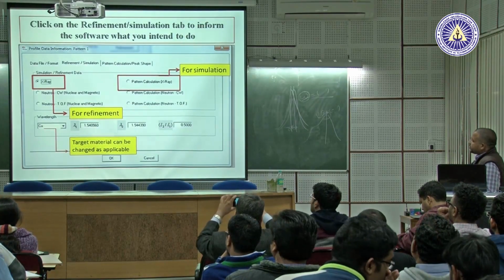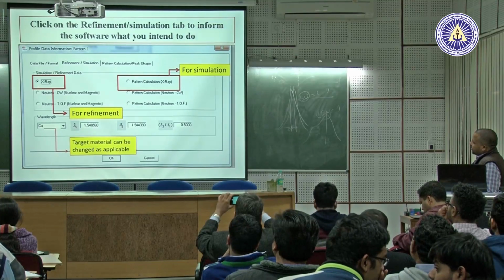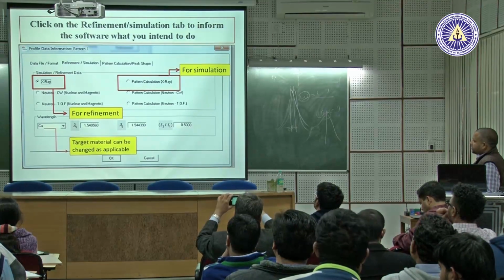Then go to Refinement and Simulation, X-rays and pattern calculation with X-rays.